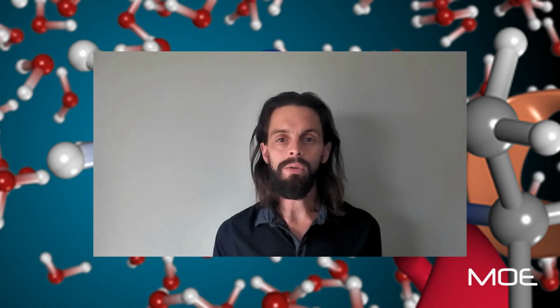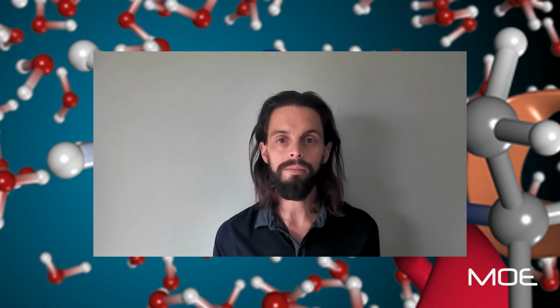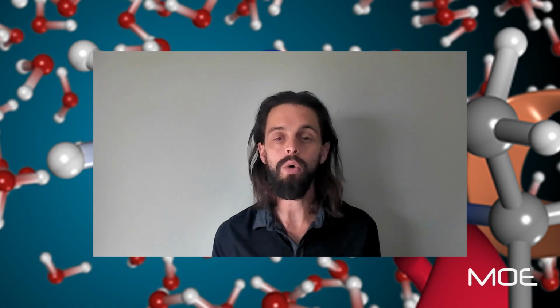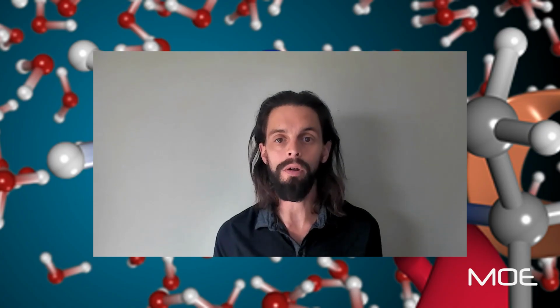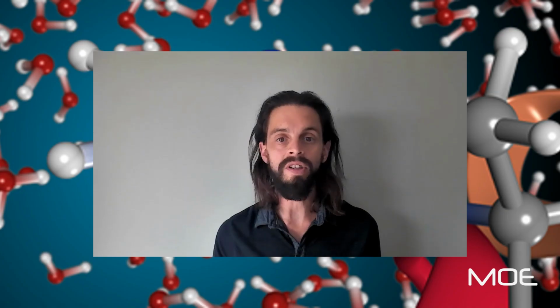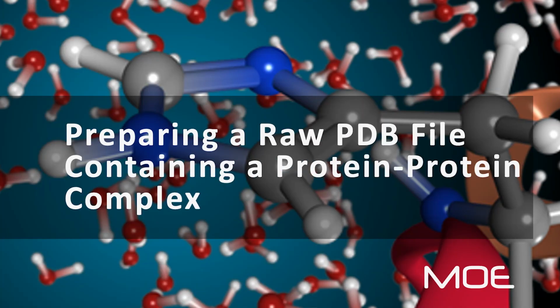Today I'd like to show you how to prepare a raw PDB file that contains a protein-protein complex. In this particular example, we'll be using an antibody-antigen complex, but this could be applied to any protein or proteins that do not have a small molecule bound. Once prepared, the 3D molecular structures can be used for tasks such as interactive analysis or for docking. So let's get started.